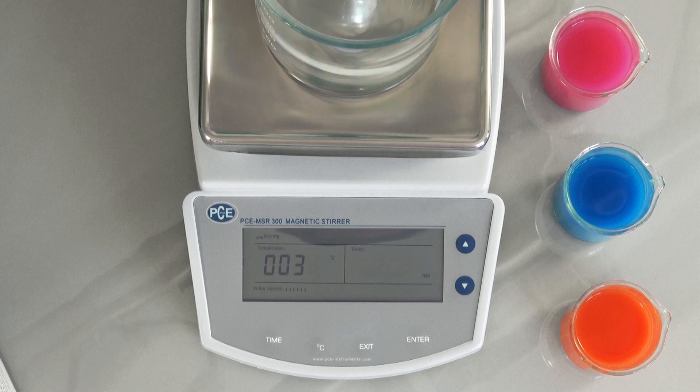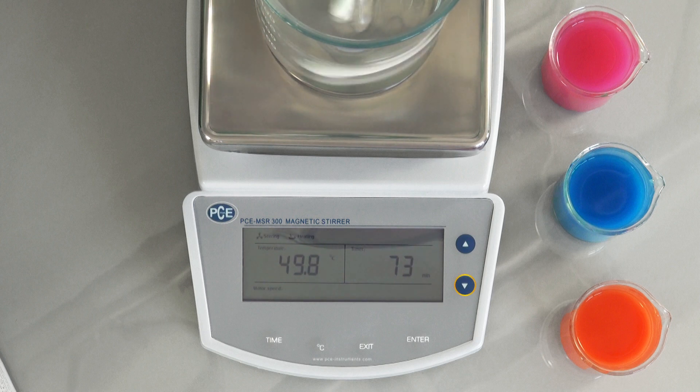By pressing the arrow keys longer it is possible to set the degrees in 10-degree steps. To confirm these settings, press the enter key. When the heating function is active, the heating symbol is shown at the top of the display. The heating plate can be used independently from the stirring function.